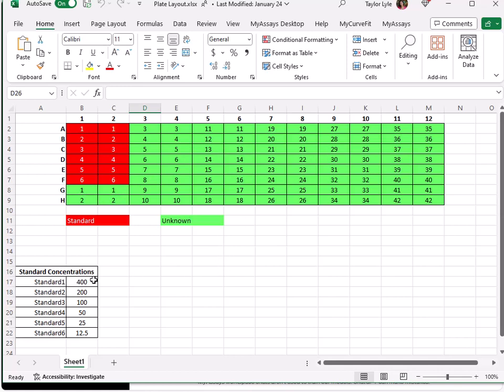My standard concentrations begin with 400 and follow a series divided by 2. I'd like to plot a 4PL fit with concentrations on the x-axis and measurement data on the y-axis. From this curve, I'd like to calculate the concentrations of my unknown samples.